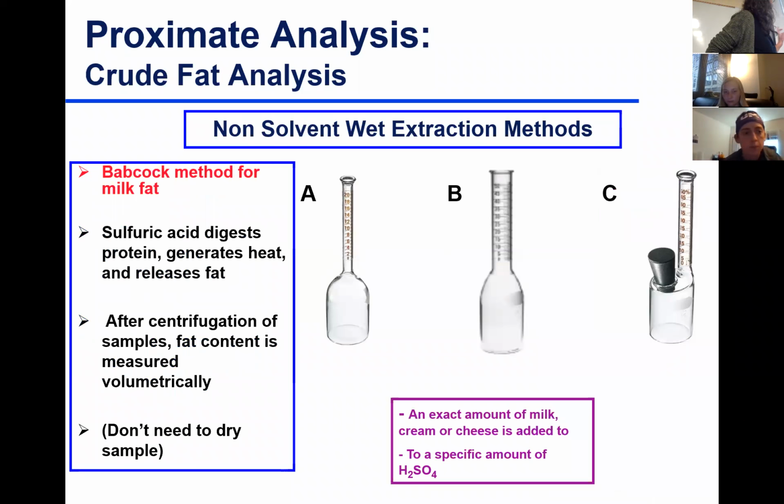You also have a non-solvent-based wet extraction method. This here is the Babcock method for extraction, and it is done mostly for dairy products. So you have a special flask. We call them Babcock flasks. Babcock is the professor from Wisconsin who developed this method. There's Babcock Hall in Wisconsin, in the food science department, named after Babcock.